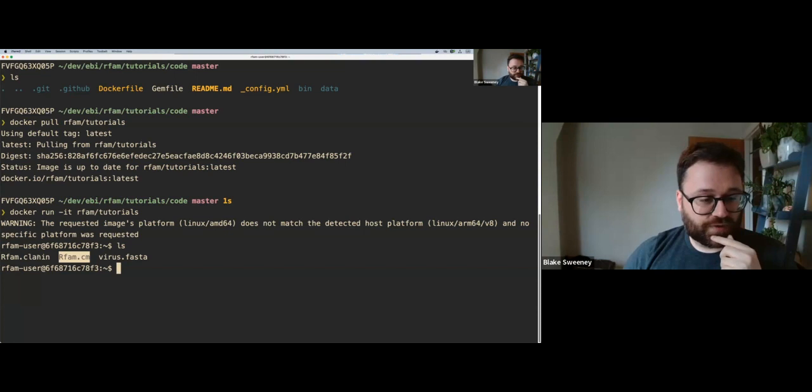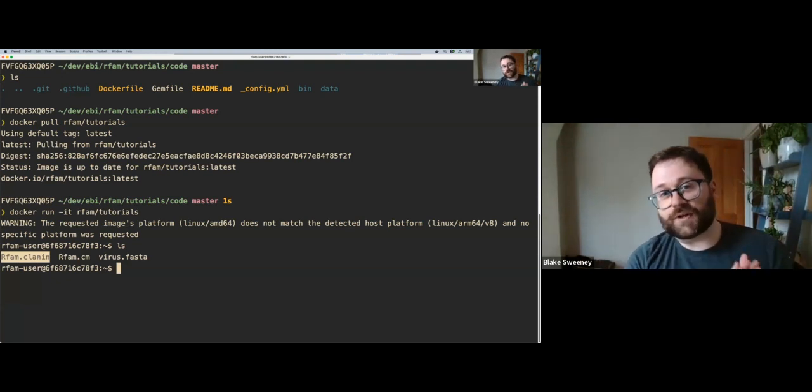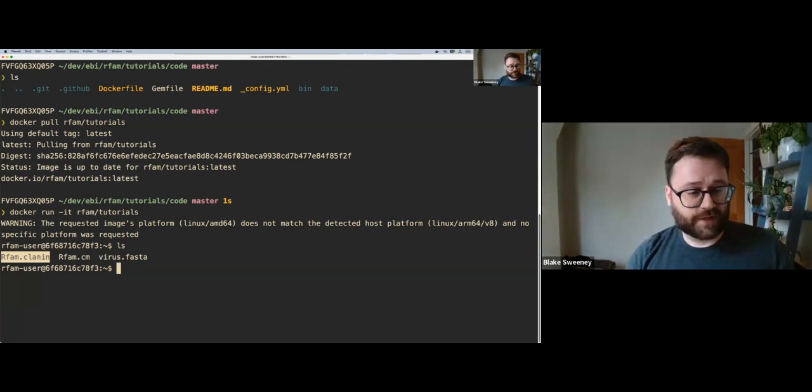And then there's also this Rfam.clanin. So many Rfam families are very similar to each other. Maybe it doesn't surprise you that all these, say, small subunits look kind of the same because they all have fundamentally a similar structure. And so clans are a way that we deal with that duplication of matches, of hits in the genome. And so we also encourage you to get that clanin file.